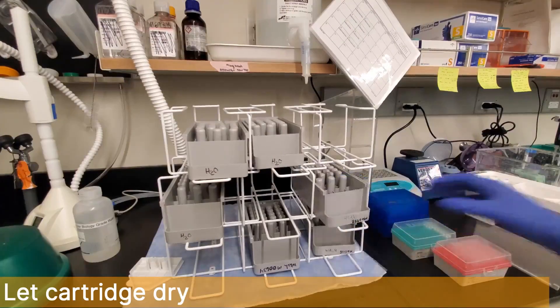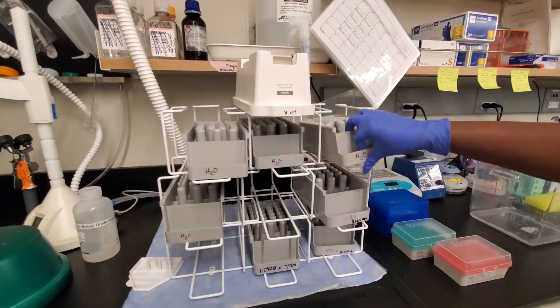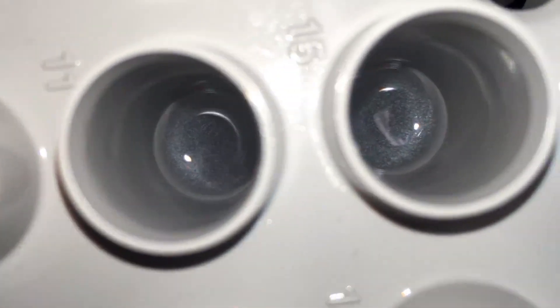Place the wash cartridge upside down with space to allow airflow and proper drying. Inspect the wash cartridge wells for contamination. This can include black or pink discoloration.